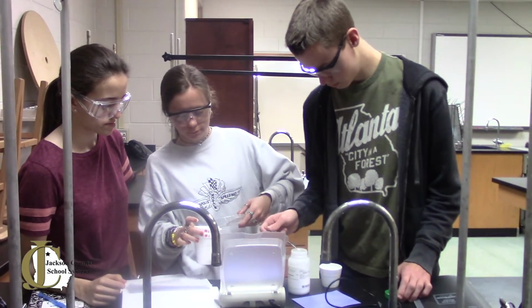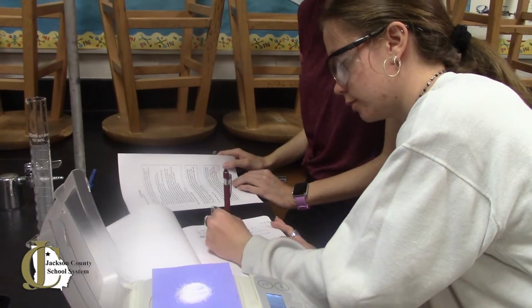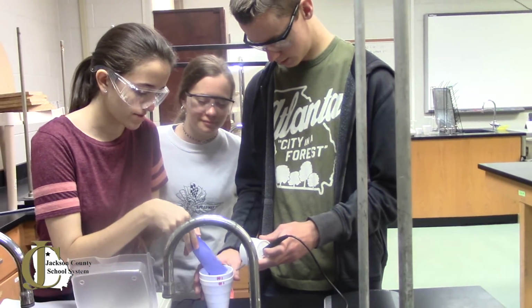Then go ahead and pour this in here. For this particular lab, I gave them a question that they were going to have to answer. I gave them a day in class with their groups to come up with what materials they were going to be using, and gave them a guided list. This lab actually does come from the argument-driven inquiry book. They were given the materials and a question to answer, and then they were given the day to come up with a procedure. What data did they want to analyze, and in what way were they going to analyze it to solve the problem? These kids develop their own procedures.